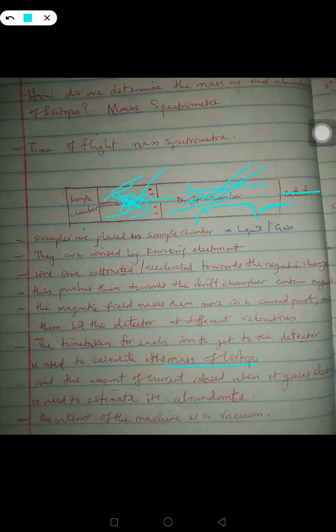Now I want to explain that. Remember I told you that when electrons move and they hit a particle in the compound, they knock out an electron. When an electron moves and hits another atom, it's going to knock out an electron from it. So it's similar to the way that ions, and remember these are ions, they are charged particles, work. Once they hit the detector, there will be a flow of electric current. It's very important. Once they hit the detector and the detector is about to find out the kind of atom that has hit it, there will be a flow of electric current.